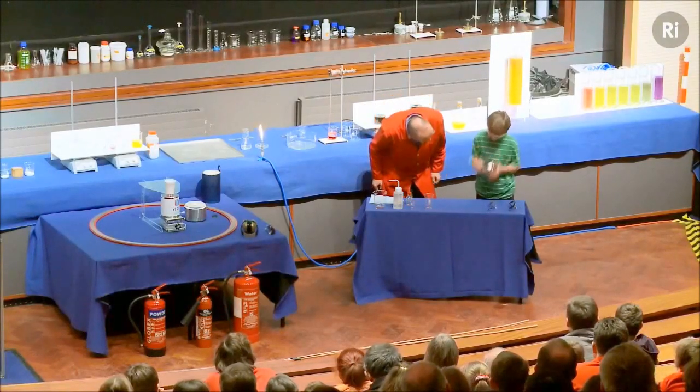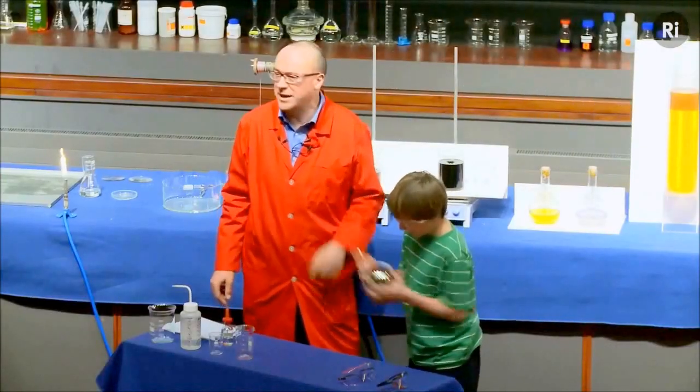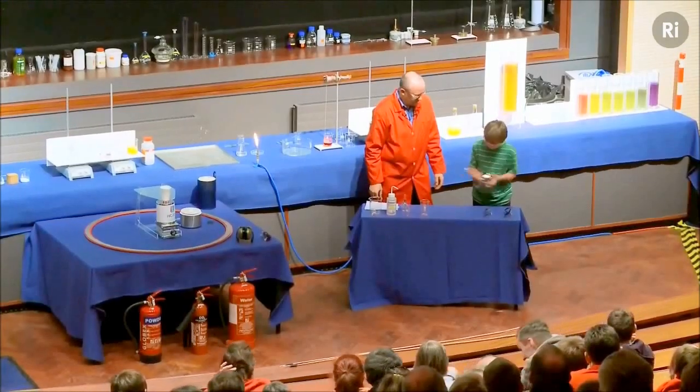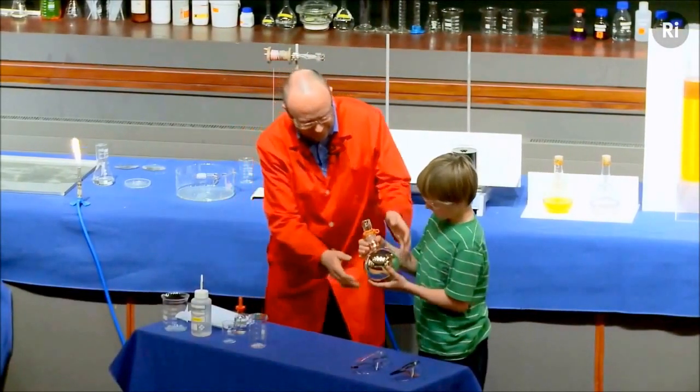Doing really well. Let's have a quick look. Almost there. Keep going a little bit longer. Still looking a little bit dark. Excellent. Give it back to me then.